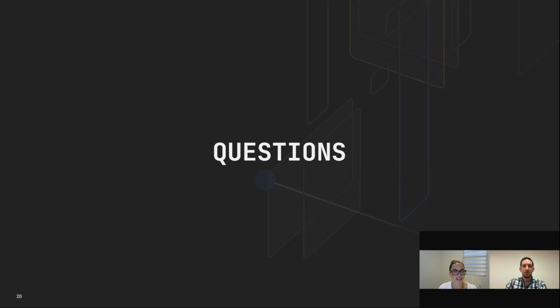Great, thank you. The next question that we have here is, considering the recent advances in AI, does the software utilize any such capabilities? Yeah, so I think there's no industry anywhere right now that isn't having this AI discussion in some way or another. It is something that we're looking into when it comes to method development and how you speed up that process of designing a workflow.